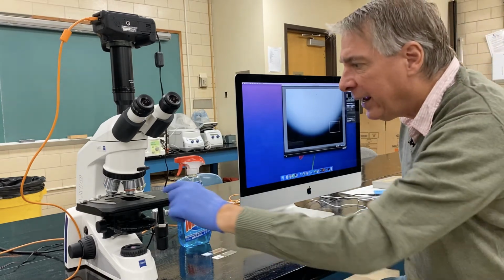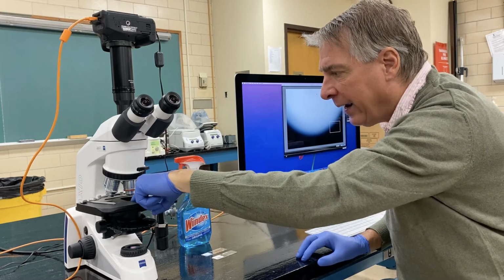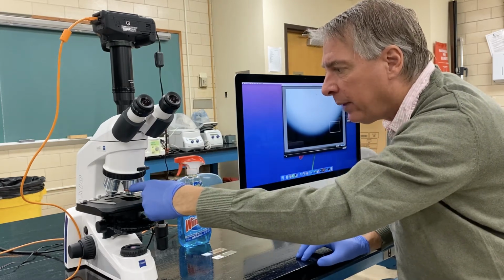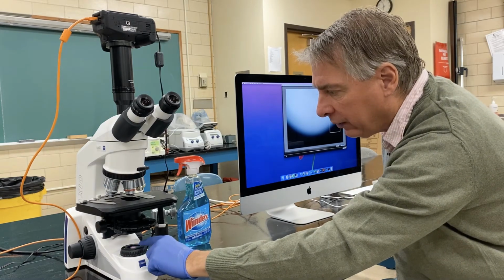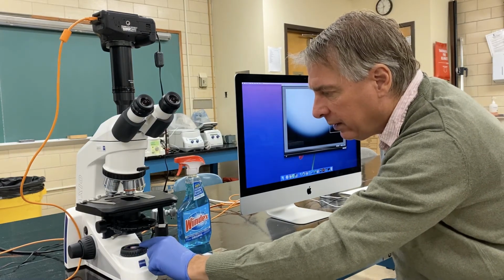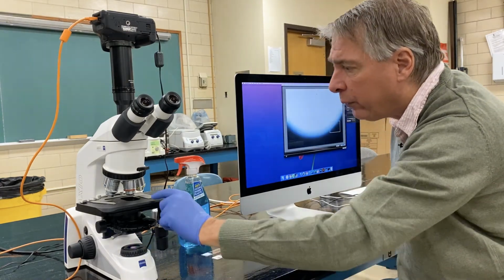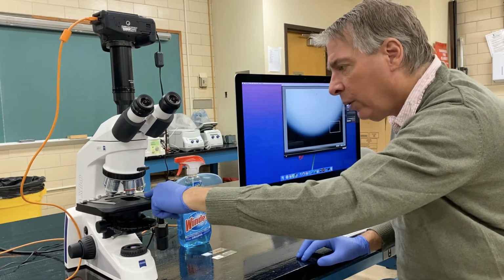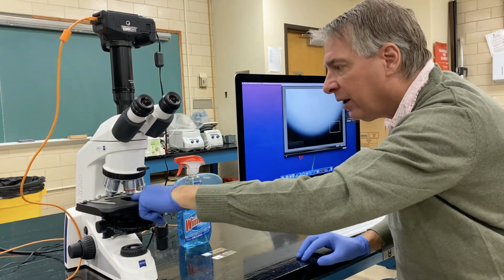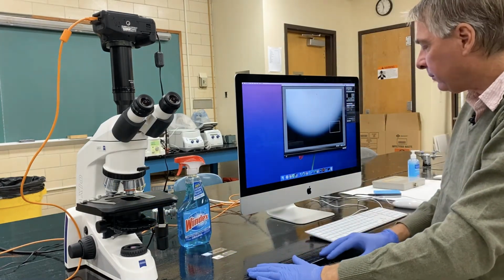So the condenser lens is a lens below the microscope stage, pointing up towards the microscope objective, and that's receiving light from the light bulb in this field diaphragm. So the light's coming out here, going through the condenser lens, and will shine light, focus light on the sample itself, and I'm going to show you how to do that.